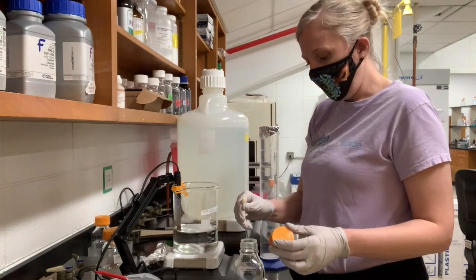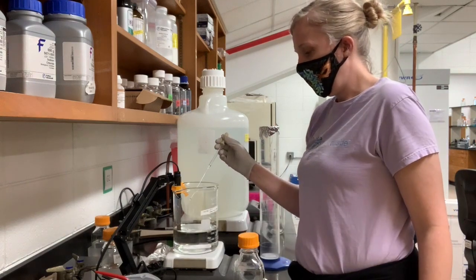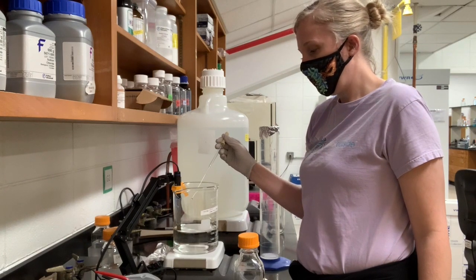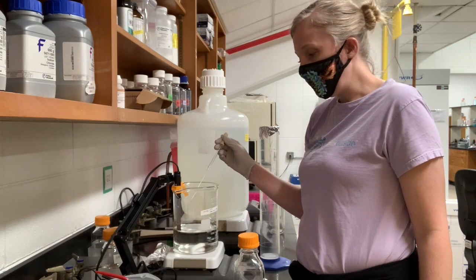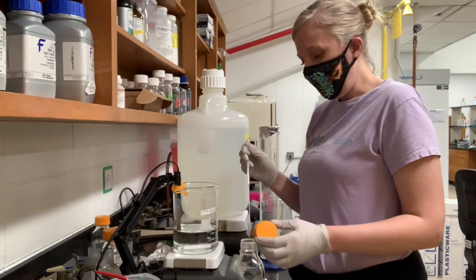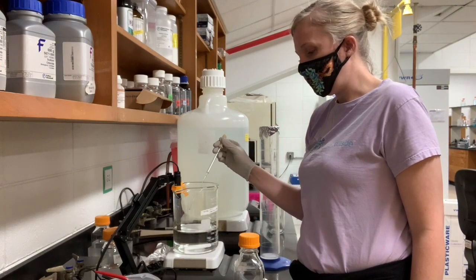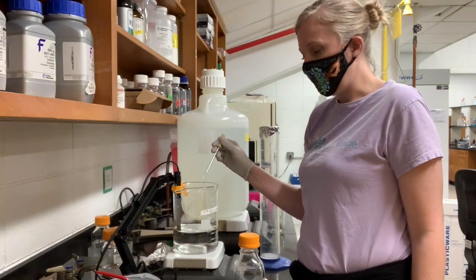And so I've added a little bit, and the pH is up to 6.72. I'm going to continue to slowly add the base until I get to 7.4. Make sure that this pH meter still has a blinking stabilizing label. If you see that the pH meter stops changing pH or says ready, then you need to hit measure again so that the pH meter will be actively measuring the pH of the solution as you titrate the pH.